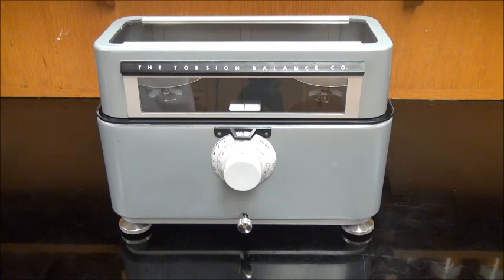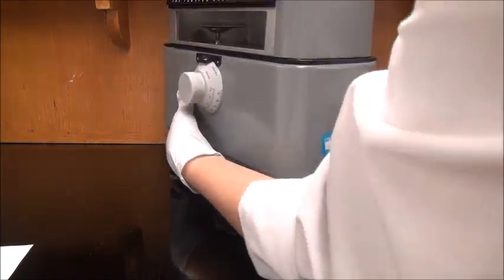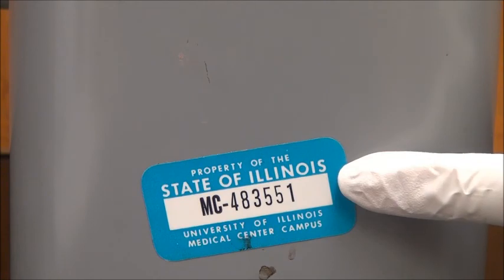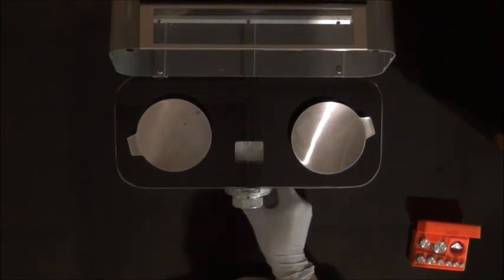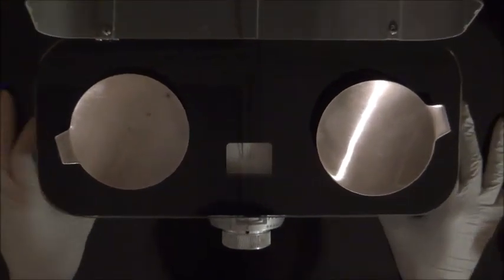Test data should be recorded in tables provided and results are calculated using calculators or spreadsheets. Before you begin, make sure you record the balance identification number from the UIC asset tag or other identifying number. This can be located on the side of the torsion balance. Next, level the balance without any weights on the pans. Adjust the balance until the needle is in the middle of the marker plate. The balance is now leveled. Arrest the balance.